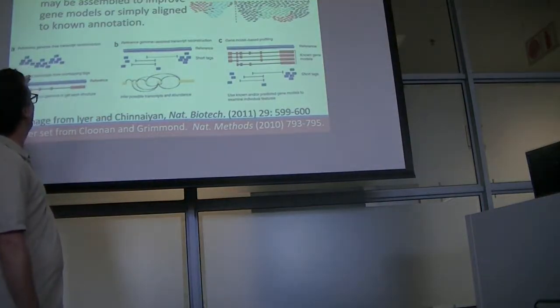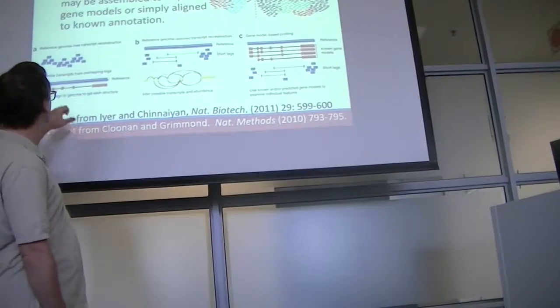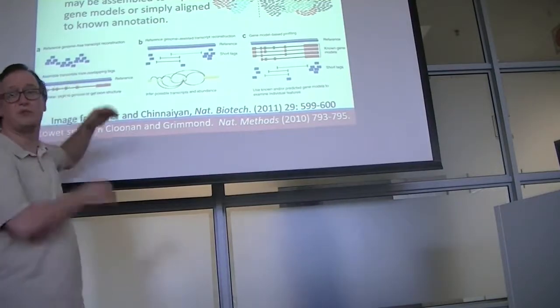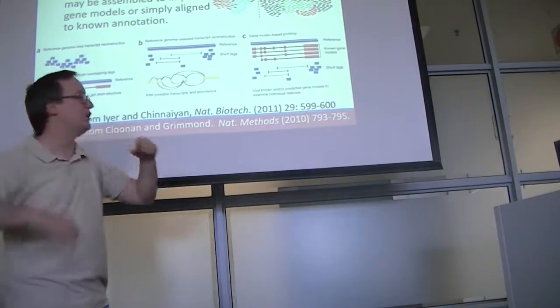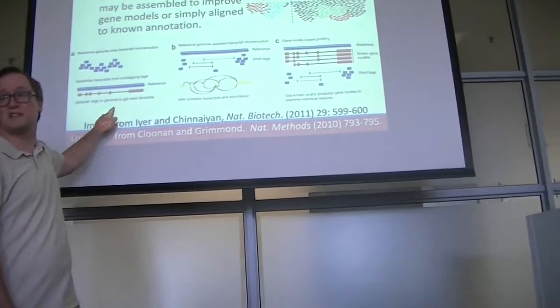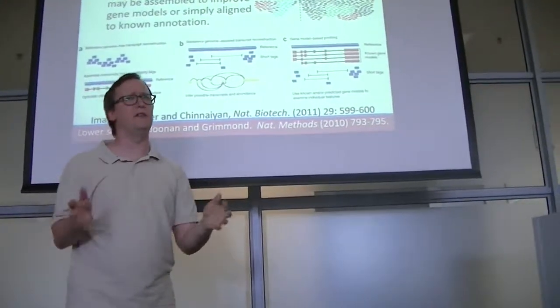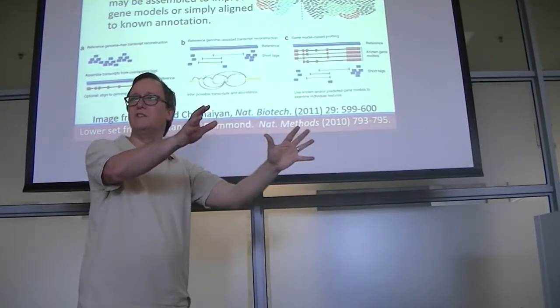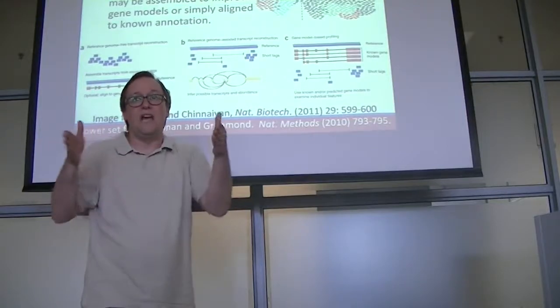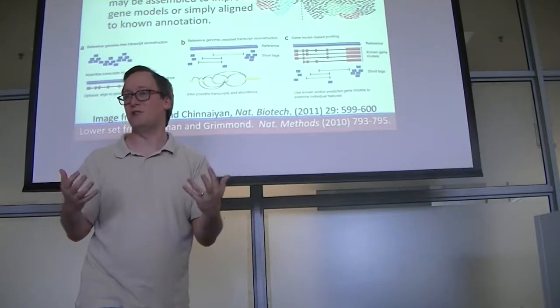So over here, we have a whole bunch of reads that we've produced across a gene. We can assemble these transcripts to recognize where these reads align with each other, and even align to a genome to say which exons map to which reads. This is what we were looking at in the last slide. So here we have an awful lot of information. We've got sequencing reads. They in themselves can be used to produce an assembly. But at base, we have a gene model that we can associate all of these with. That's really the best alternative.